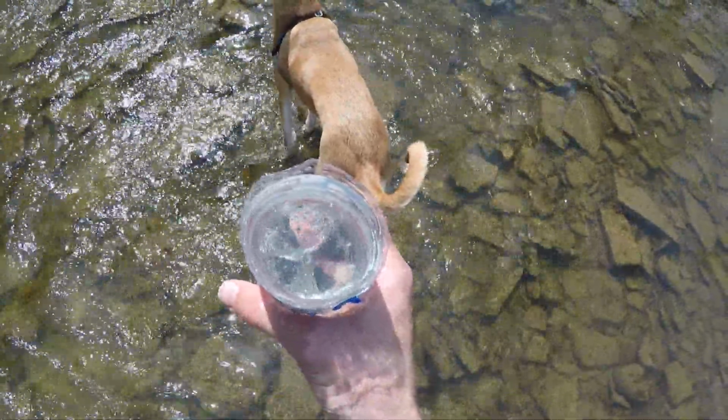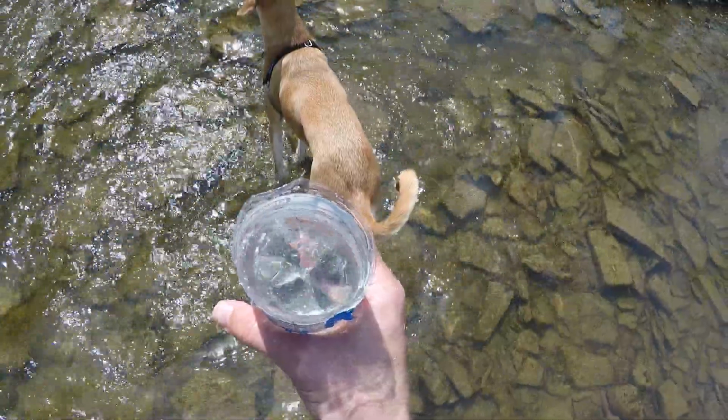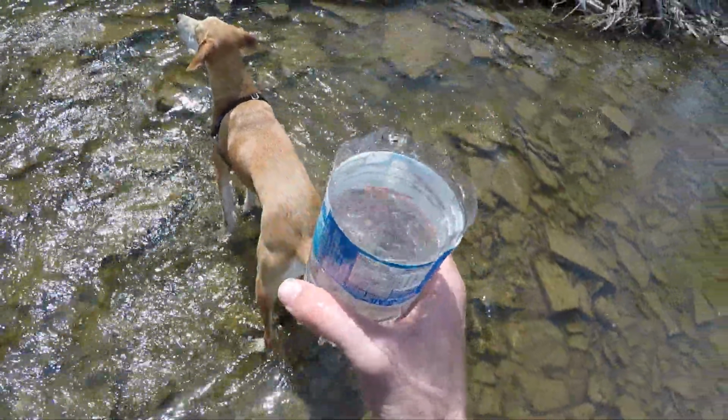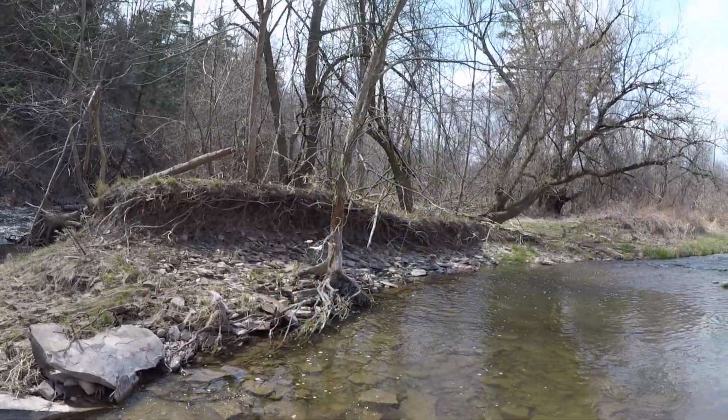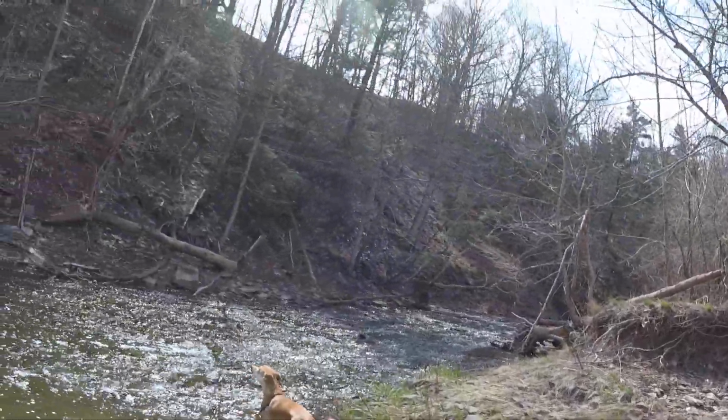So this is not turbid, I would say. So when we record it, we can say greater than 14 centimeters will be our measurement. So it's going to take something greater than 14 centimeters for us to obscure the bottom.